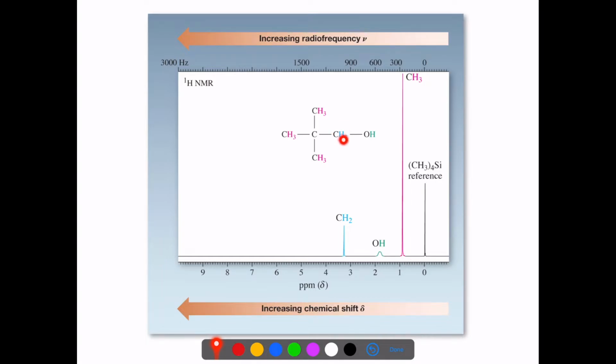Notice, however, these hydrogens, not only do they have the carbon and those red hydrogens nearby, but they have this oxygen atom, which is electronegative. And remember, oxygen was sort of close to the top of that last table, and so those are de-shielding these electrons to a greater extent, making them have further absorbance downfield. So notice it's here, CH2, and again, it's because they're here. And then notice the alcohol peak is right here. Again, it's also attached to an oxygen, and so it's further downfield than we would necessarily expect.